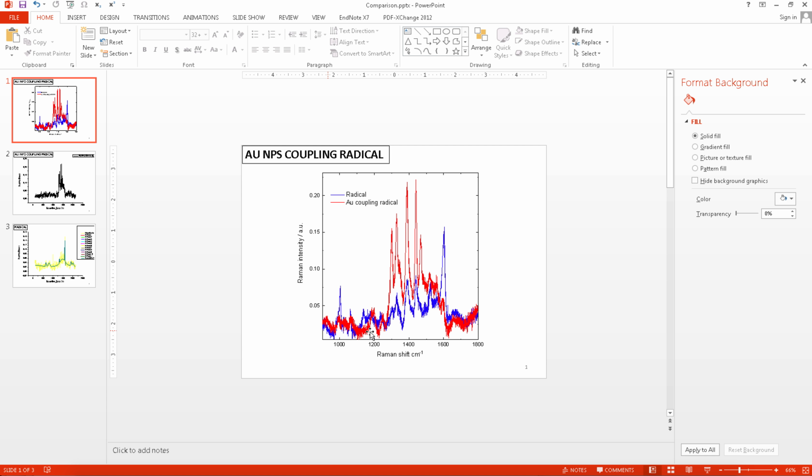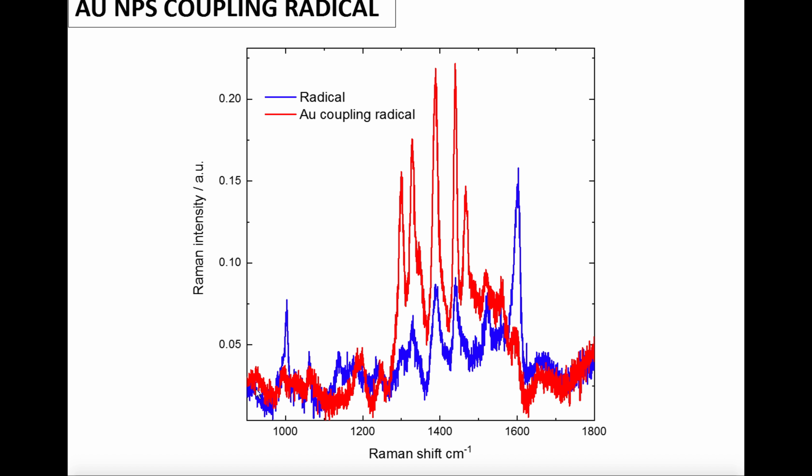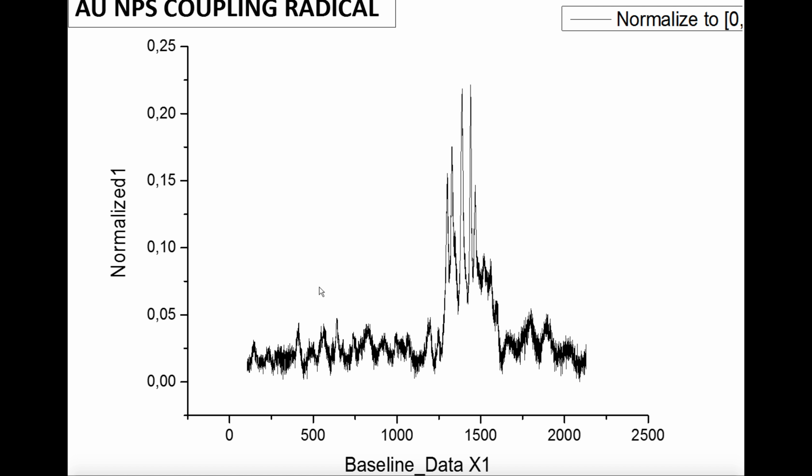Now forget about the other. You see the wave number I'm using here. I'm not focusing on below or above. This is the carbon region, the fingerprint region of these carbon molecules. So this is the spectral region where you have to focus on. See here the peaks that change in intensity ratio. Those are the peaks that you care about. Okay, that's it for now. Good luck.